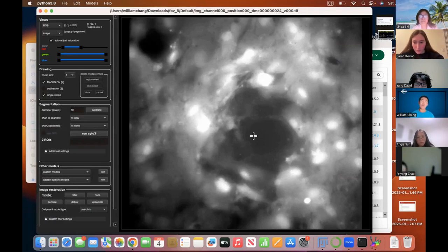You'll learn more about your individual projects, but a rundown of what's seen here is that we use a very high-powered laser to strike the center of a cell culture. When it impacts the cell culture, it's like a ripple in a pond if you throw a stone into the pond. The ripples expand outwards, and the bright spots here are actually cells that are either dying or upregulating proteins to facilitate cell repair.